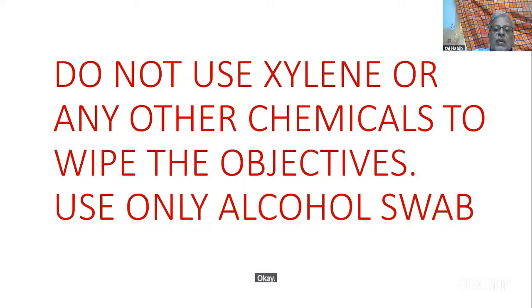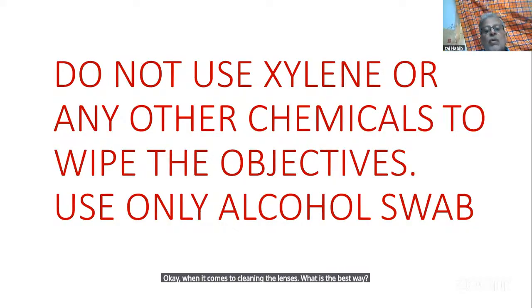Okay, when it comes to cleaning the lenses, what is the best way? Use commercial alcohol swabs. Nothing else. Never use anything else. No xylene, no any other chemical. Just commercial alcohol swab. Perfect.